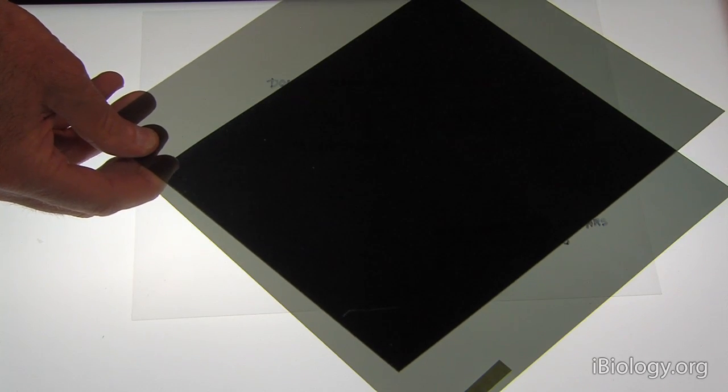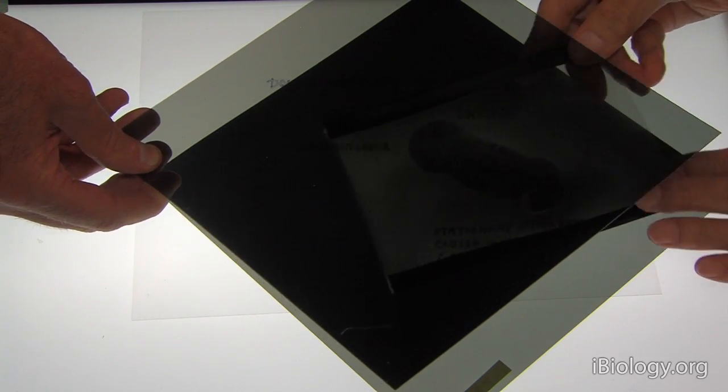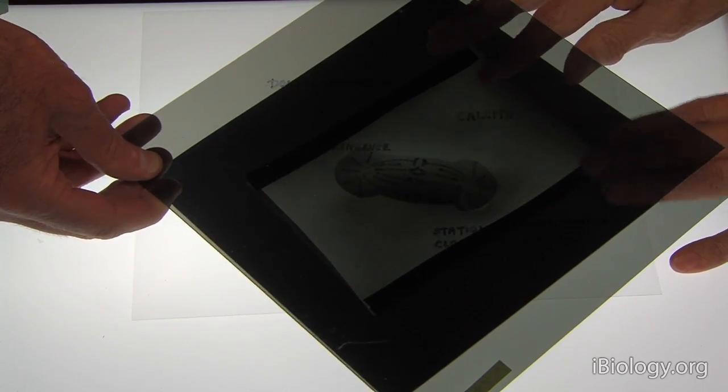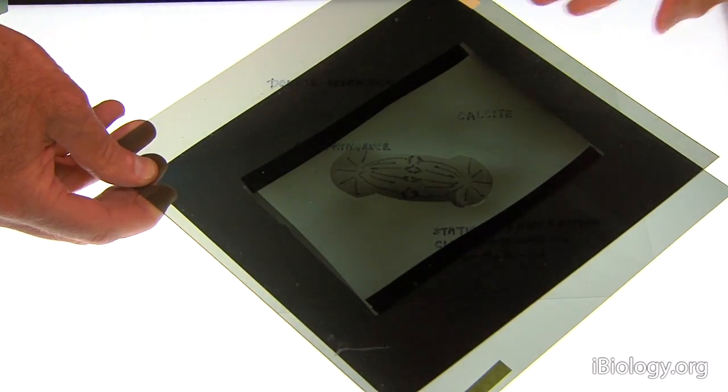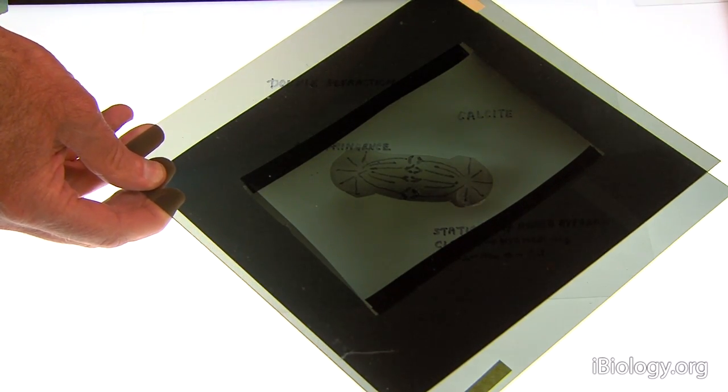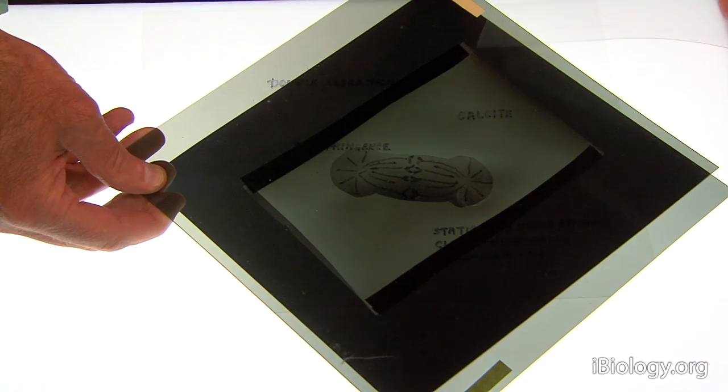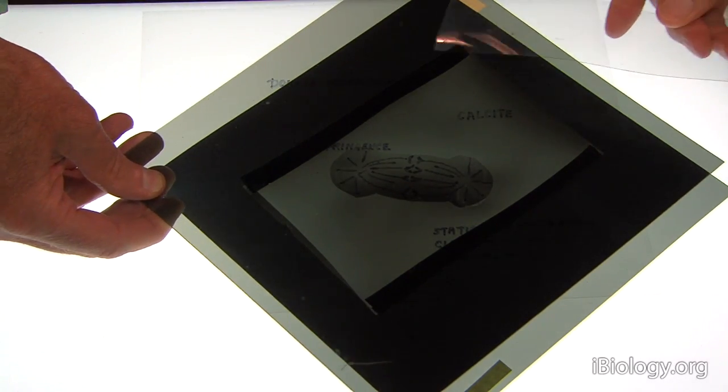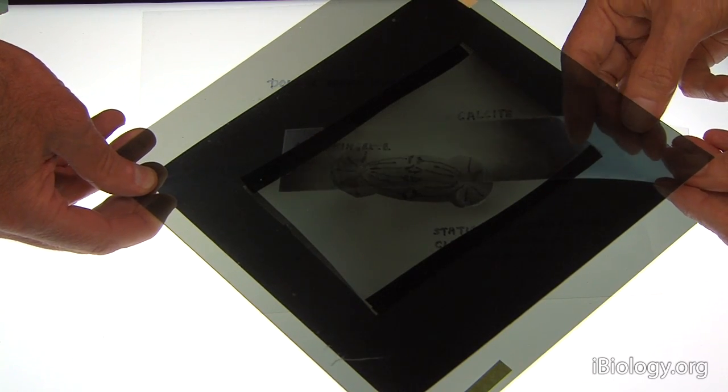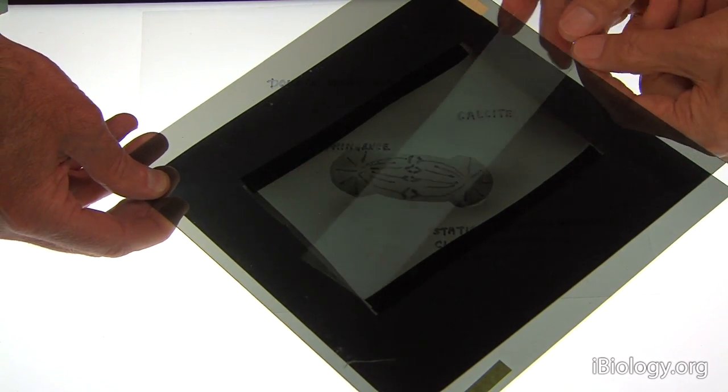Instead of the calcite crystal, I'm going to put a birefringent biological sample here, which you may just be able to see or not because the contrast is terribly weak between cross polarizers. But now I'm going to put another birefringent material, and it should become brighter or darker.